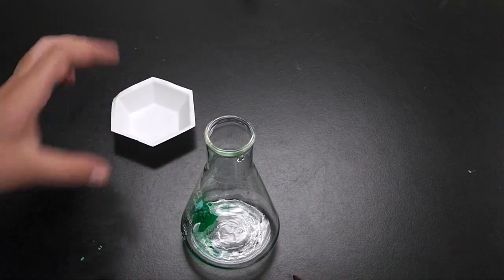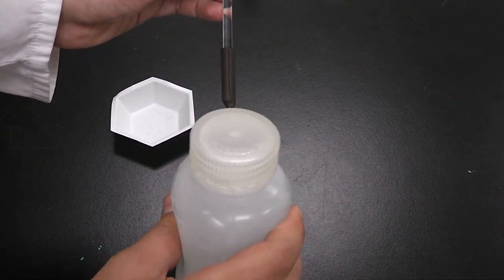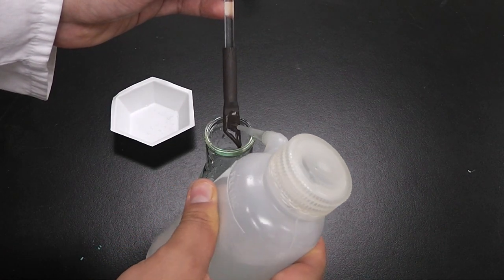When you've made sure that all the sample is washed into the Erlenmeyer flask, don't forget to rinse your rubber policeman as that will probably have sample on the edges.